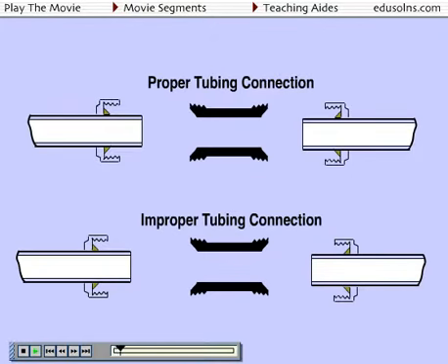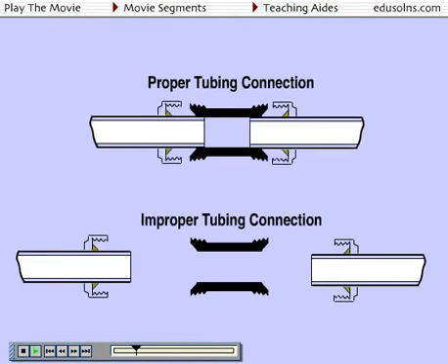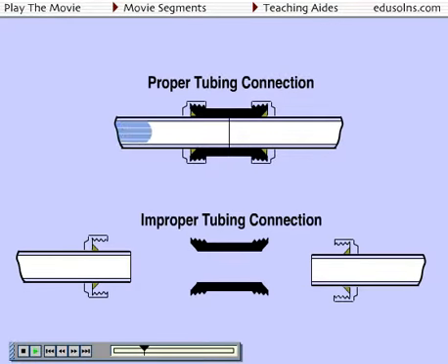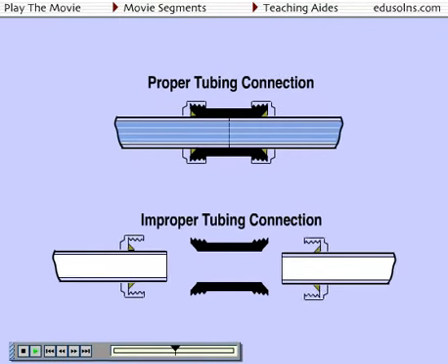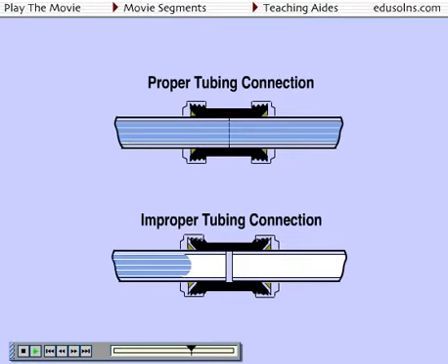Another common source of poor resolution is mixing at tubing or component connections. The top figure illustrates how a proper fitting connection should be made. The ends of each piece of tubing should be as close to perfectly even as possible. When this is done, the flow conditions in the tubing remain laminar and dispersion is minimized. However, when the tubing ends are uneven or when they do not adequately meet, the laminar flow lines are disrupted and turbulent mixing occurs. This increases the dispersion, and if this type of connection occurs after the sample has been introduced to the system, poor resolution will result.